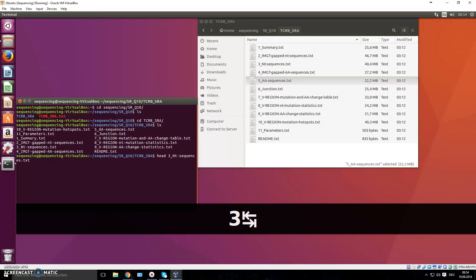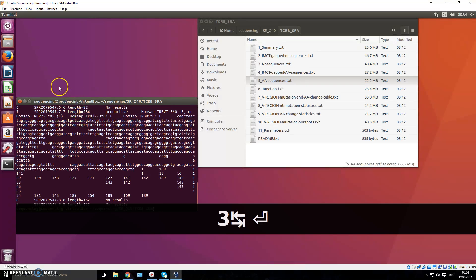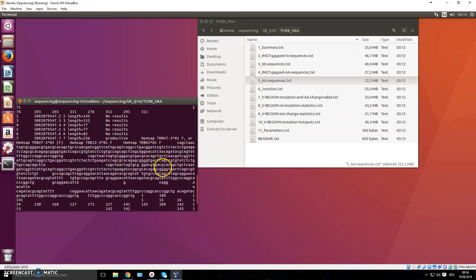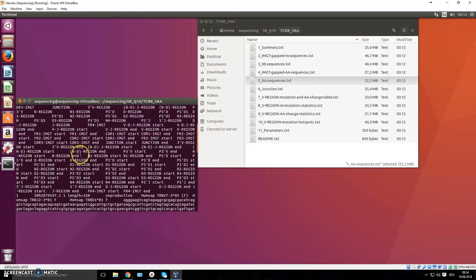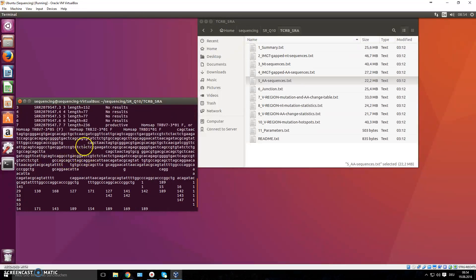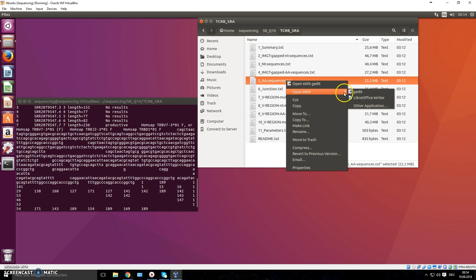This is a bit difficult to understand if you're just looking at it in your terminal — you can see this isn't very helpful, you can't really read anything out of it. What this file format is made for is bioinformatical pipelines that you've written, so that you don't actually open and look inside it but instead manipulate it via scripts. You can learn how to do that at nextgenerationsequencinghq.com.